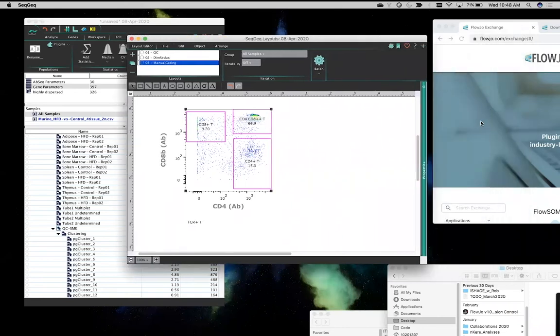Another question coming in. I'll read that aloud and just give a little answer to that. Is it possible to gate cell types based only on RNA expression? Certainly it's possible to gate on the RNA, and people will do that pretty frequently for a certain set of markers that people are very interested in. Usually in the samples that you're looking at, you have a particular set of populations that you want to find, and you might have an idea of what gene or genes are expressed there.